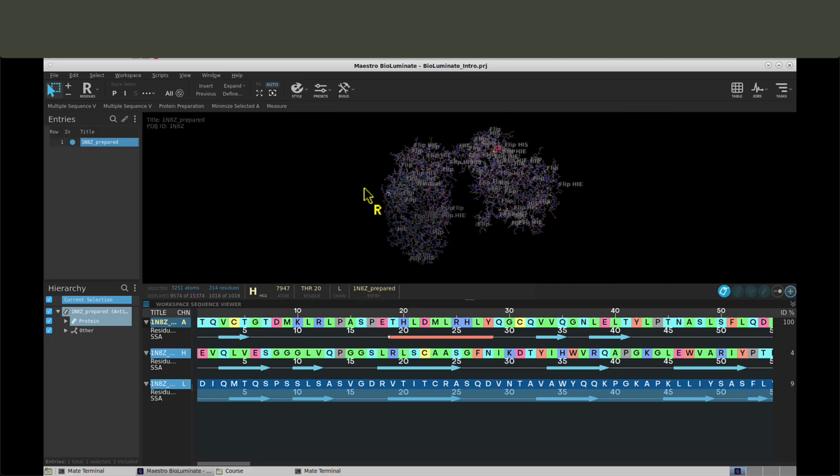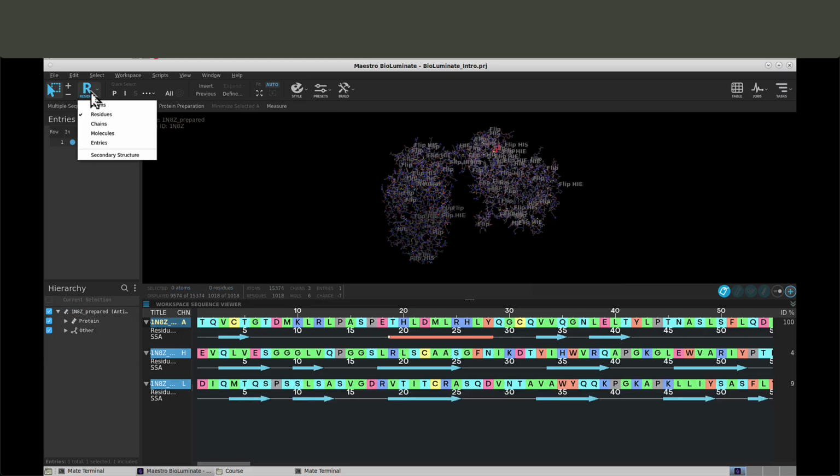Back at the selection scope, click Secondary Structure and come back to the protein in the workspace. When you hover over it, it will highlight the secondary structure in that region. Then, when you click once, now the blue spheres will encircle the whole secondary structure. Click in the empty workspace to clear the selection. Keep an eye on the letter next to your mouse cursor to remember what selection scope you currently have. You should now be comfortable with saving your projects and interacting with the workspace structures.